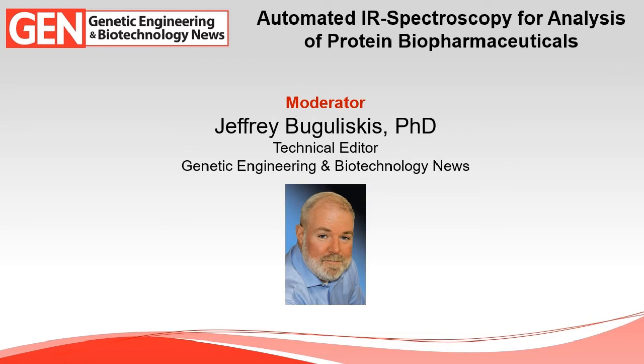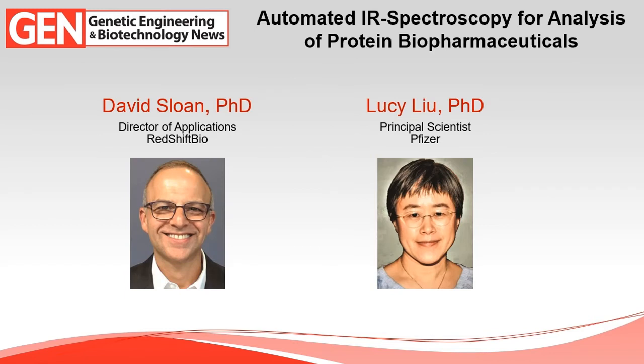Put into practice, characterization of secondary structure is paramount in determining the accuracy of biosimilar molecules. And today we're going to hear more about an automated IR technique that can aid in the characterization of protein secondary structure. Here to tell us more about MMS, or microfluidic modulation spectroscopy, are our two expert panelists.